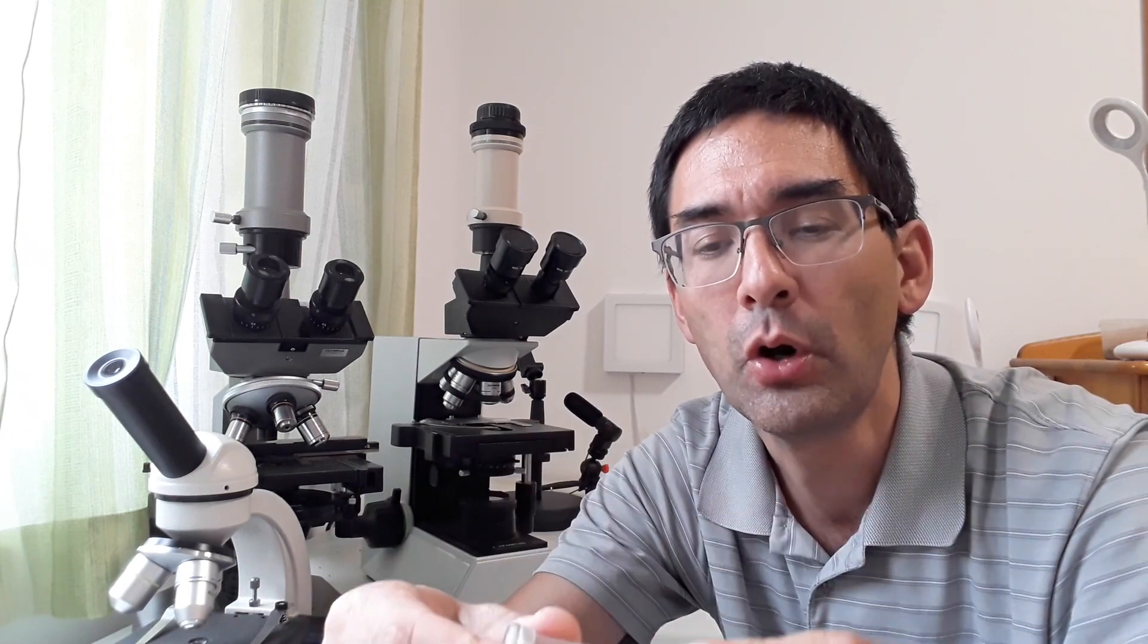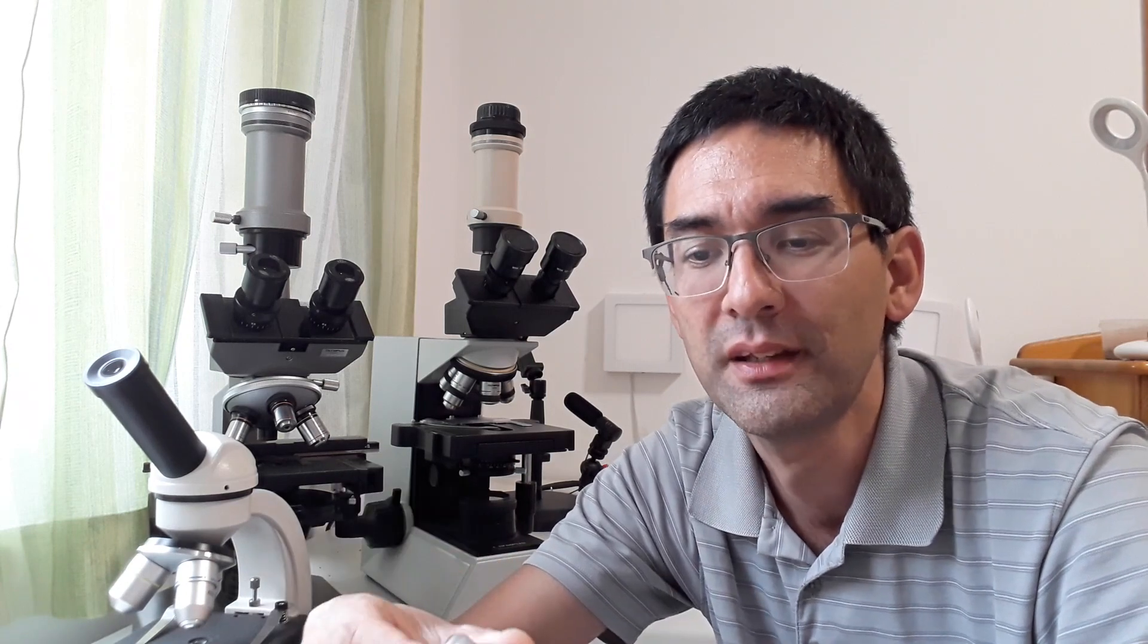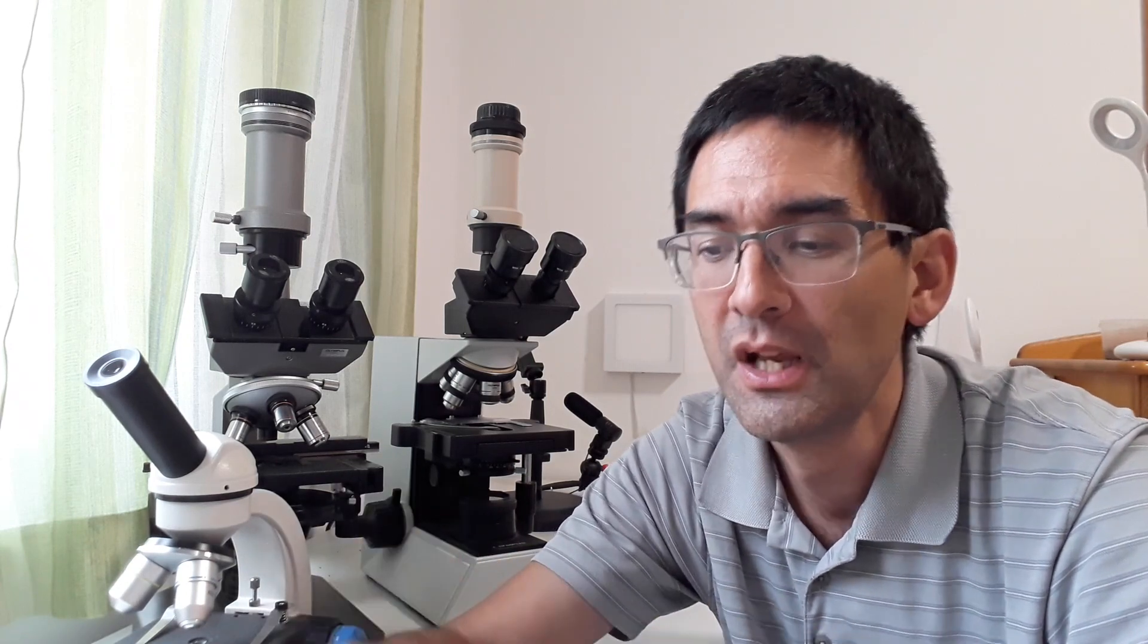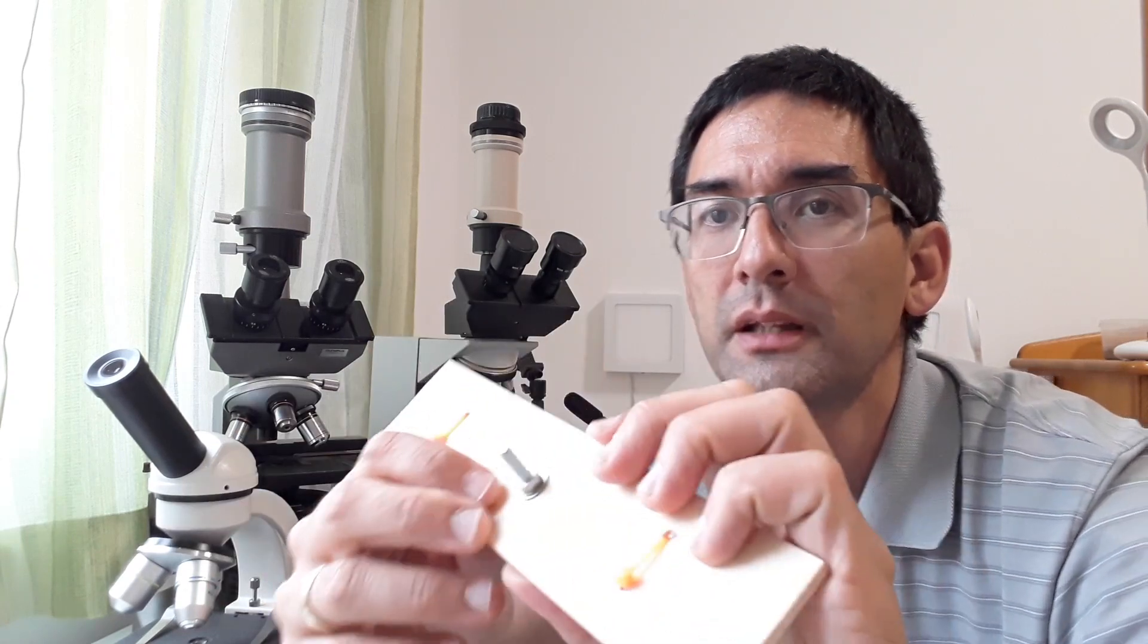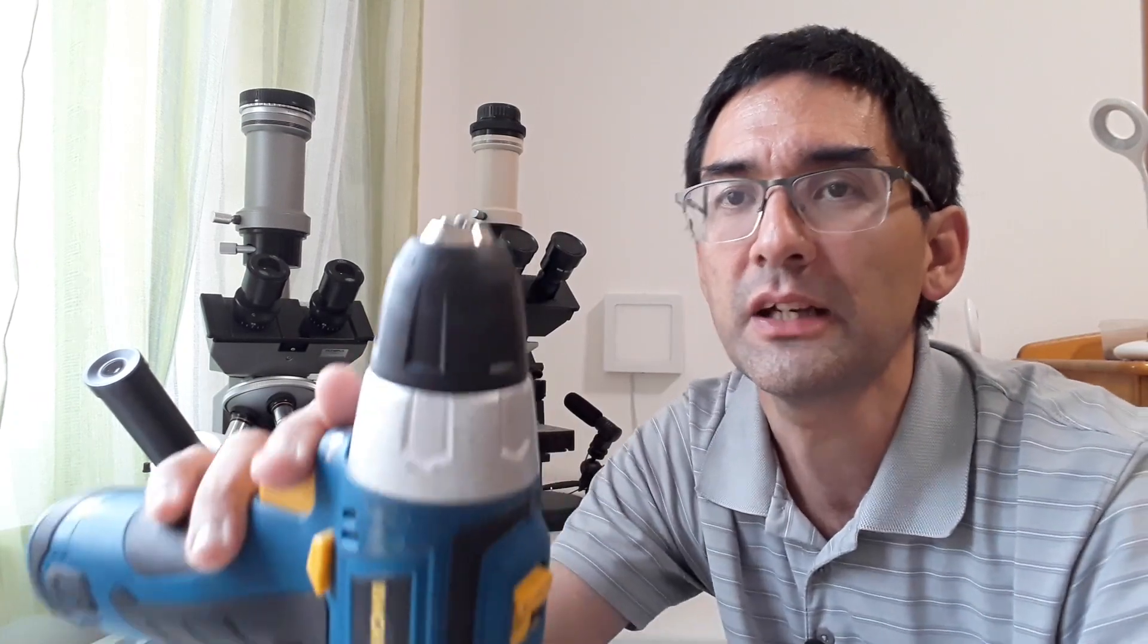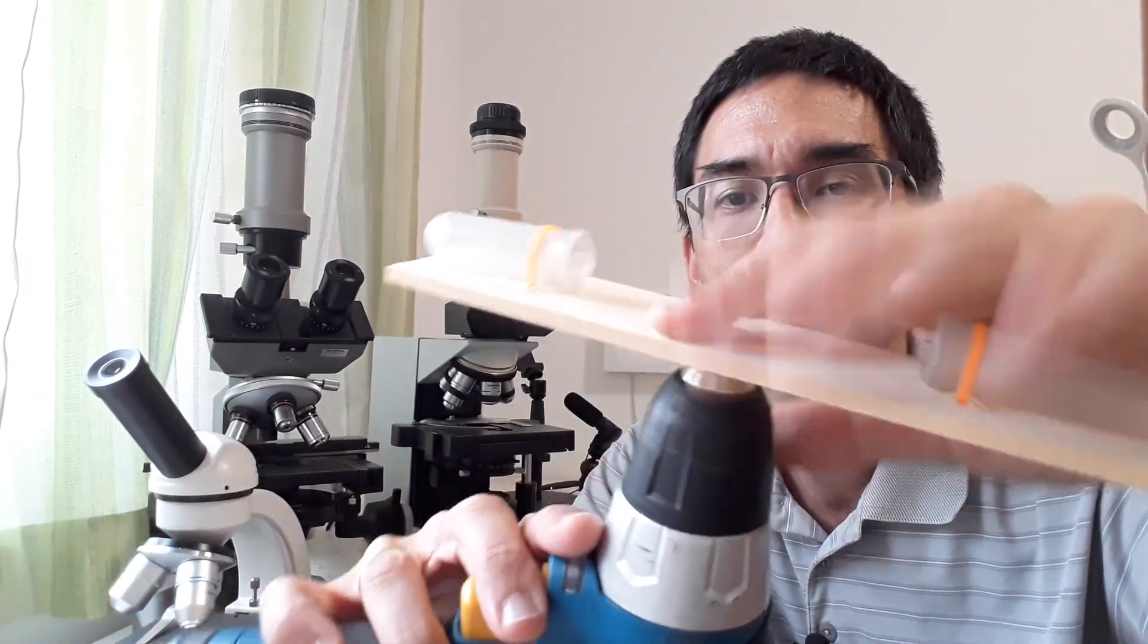This might allow you to see microorganisms you normally wouldn't see because the concentration is higher. Don't forget, if you take a sample of water and put it on a microscope slide, maybe the organisms are somewhere in the water but not on the slide because the concentration isn't high enough. By concentrating it, you actually increase the possibility. This is very easy to make: take a piece of wood, attach a screw, use an electric drill.